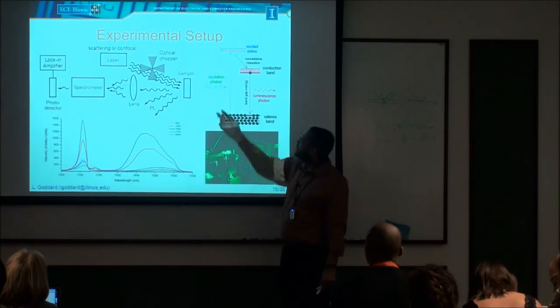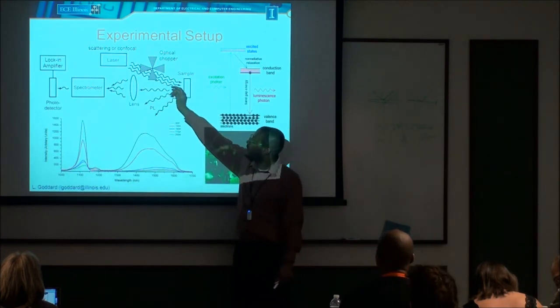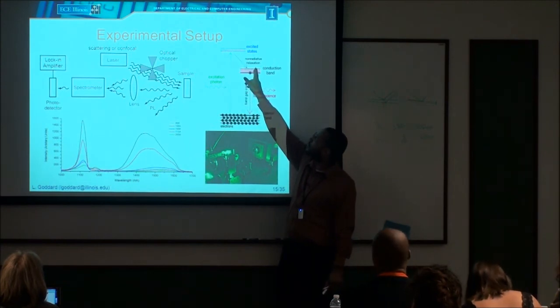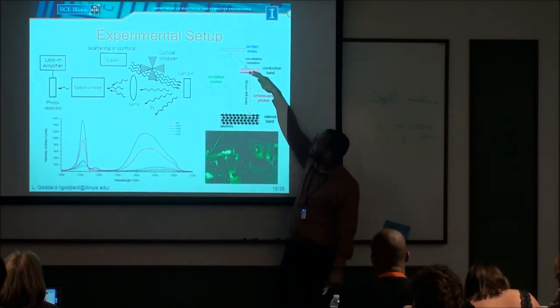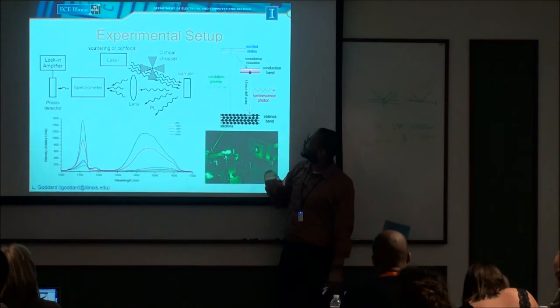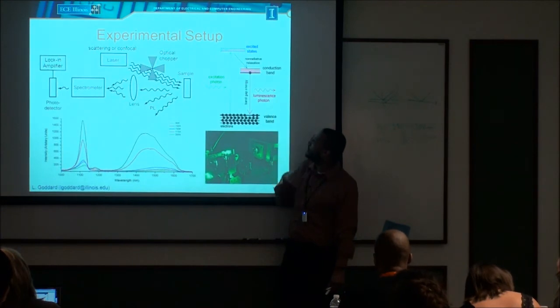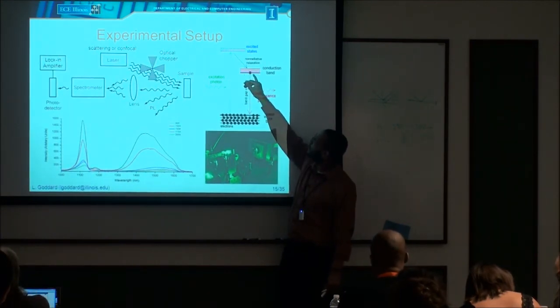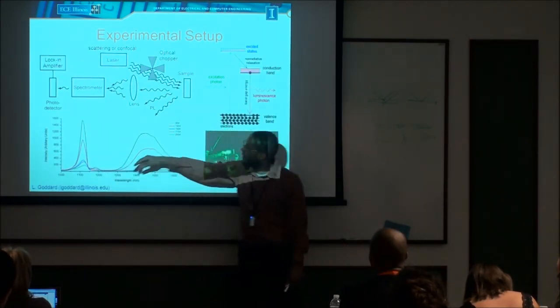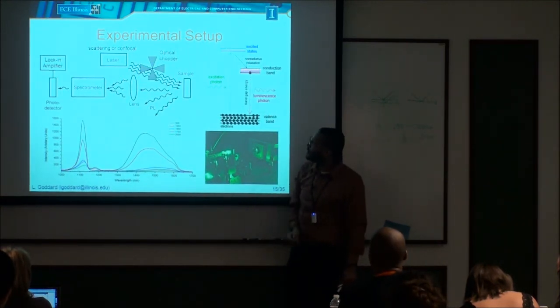The energy diagram of it is simply you have a valence band and a conduction band, and the photon that you send in from the laser source is going to excite a carrier to some excited state. There may be some non-radiative relaxation to some other state in the conduction band, and then from there you emit your light signal. This luminescent signal is what you use to figure out information about this energy transition, how many bands you have, and how pure of a material you have, because if I have a lot of different types of materials next to each other, I'll have different energy bands. The width of this will tell me how pure my bands are, and it'll also tell me information about doping and a lot of these other parameters.